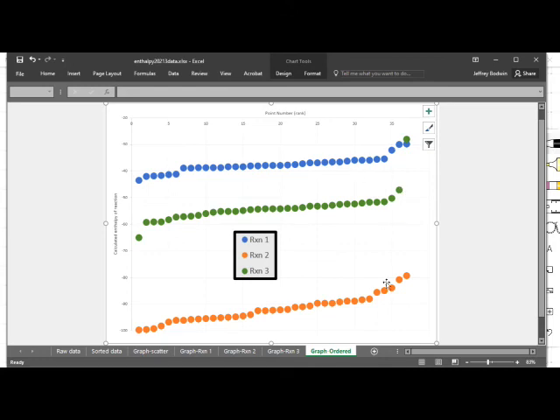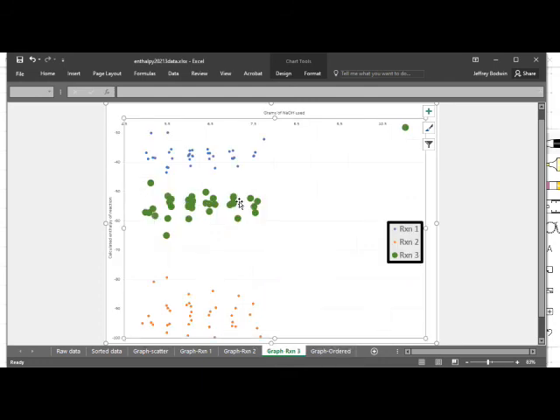That's just a couple ways of visualizing data graphically to look for outliers and look for the amount of error. If we're looking at it this way, the slope of this line actually gives us a measure of the error in the experiment or the variance in the experiment. So there are a lot of things we can do to look at error. These types of graphs are just some of the ways that we can consider both trends in the data and points that obviously end up lying far outside of where the rest of our data sits.